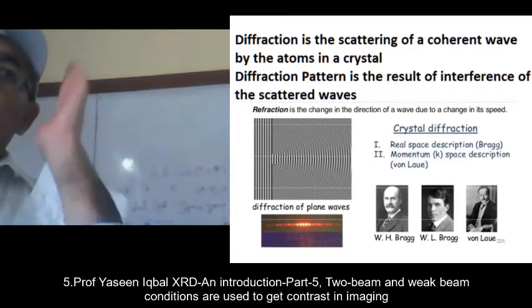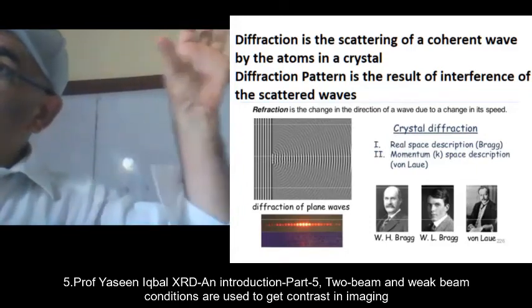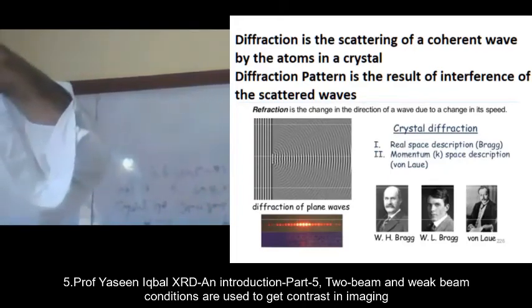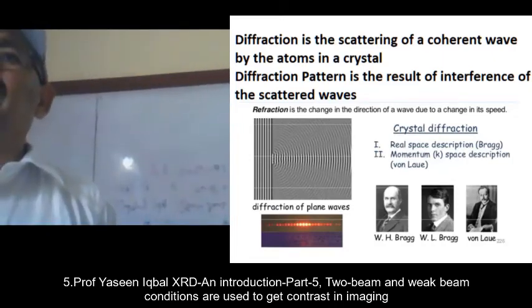Similarly, to concentrate the beam onto the desired crystal planes of the sample, you again put a slit before the detector as well, so that the randomly scattered X-rays go away.